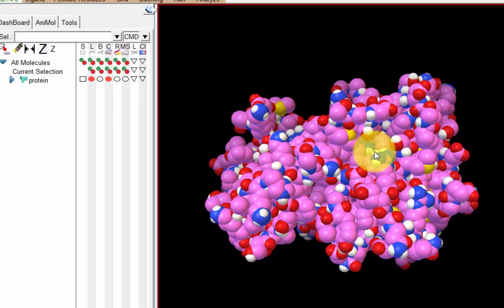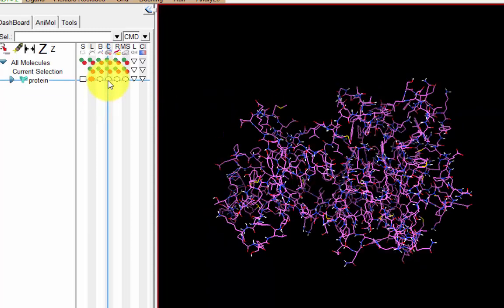Blue is nitrogen. That's the default in these kinds of representations. White is hydrogen, blue is nitrogen, and red is oxygen. And so you can see as the carbon alpha chain goes, there are all kinds of hydrogens, and the yellows are the typical for sulfur. Okay, so that's not what we want to see, but I just wanted to show you while he's talking about the surface.